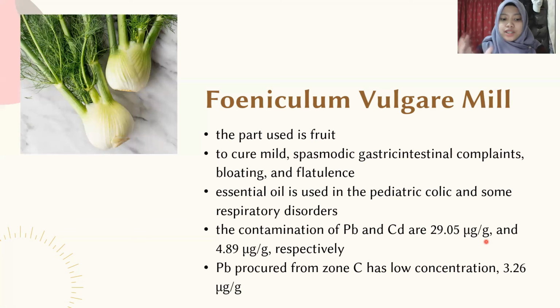The presence of this toxic metal will give rise to intoxication of the Pb and the Cd metal because it might cause harm once humans consume these herbal drugs.